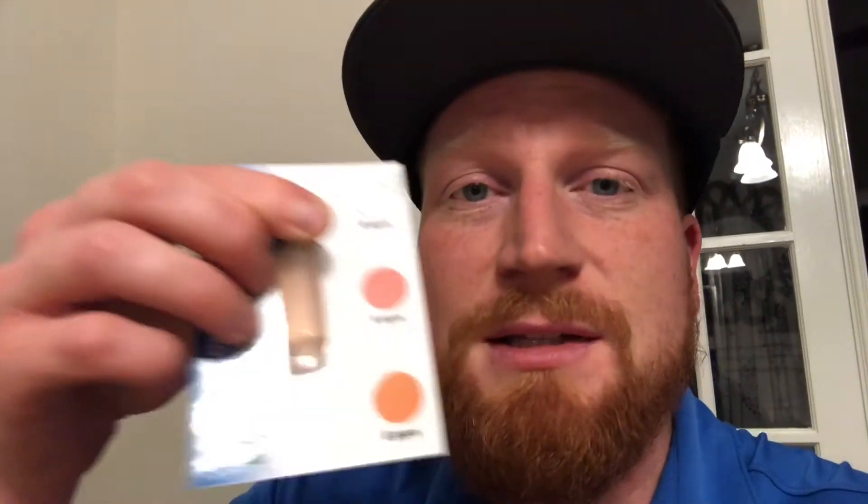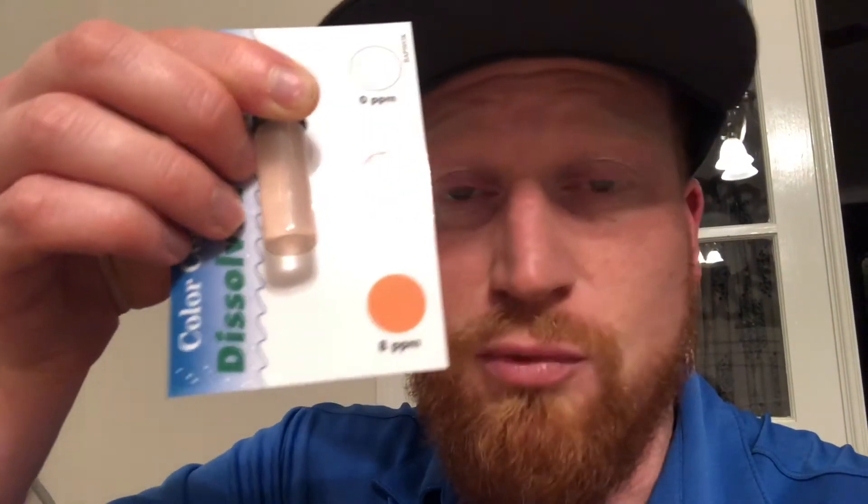If your sample stays completely clear, that's zero parts per million. But if there's at least a little bit of color, I would call it at least two to three parts per million. If your sample turns bright orange, that means you've got eight parts per million dissolved oxygen. So once you've recorded that information, please be sure to put it into your data sheet, put that information up on the board for the rest of the class, and then this water's not great — go wash your hands. Have fun, see y'all later.